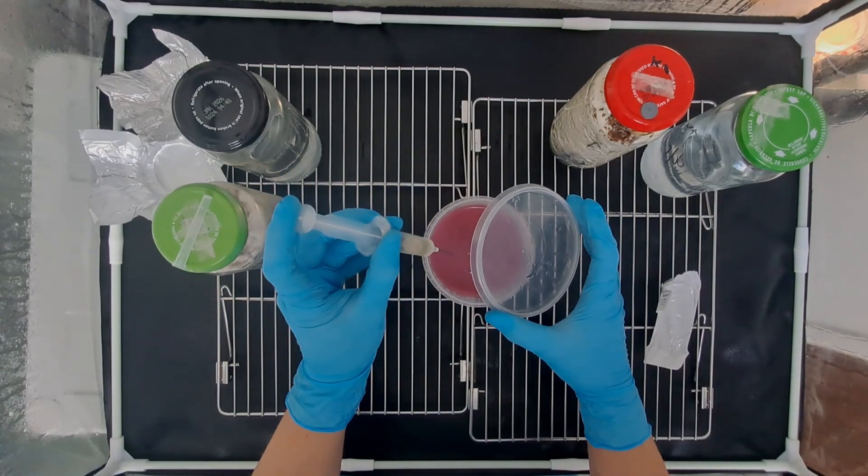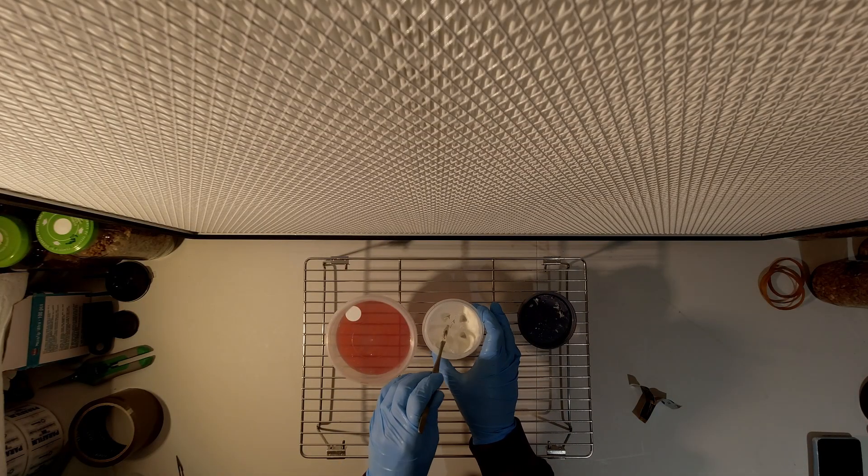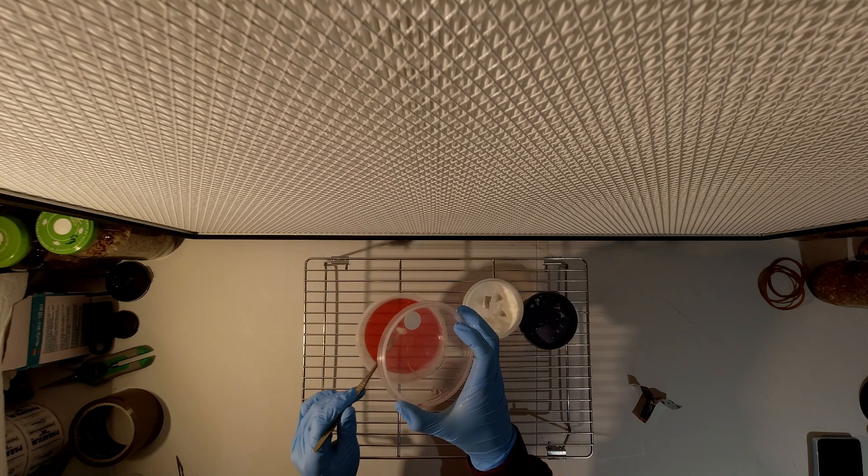Keep in mind that once your agar plate is ready you shouldn't leave it sitting around for too long before use, as this increases the chance of bacteria or some sort of contamination growing on the plate.